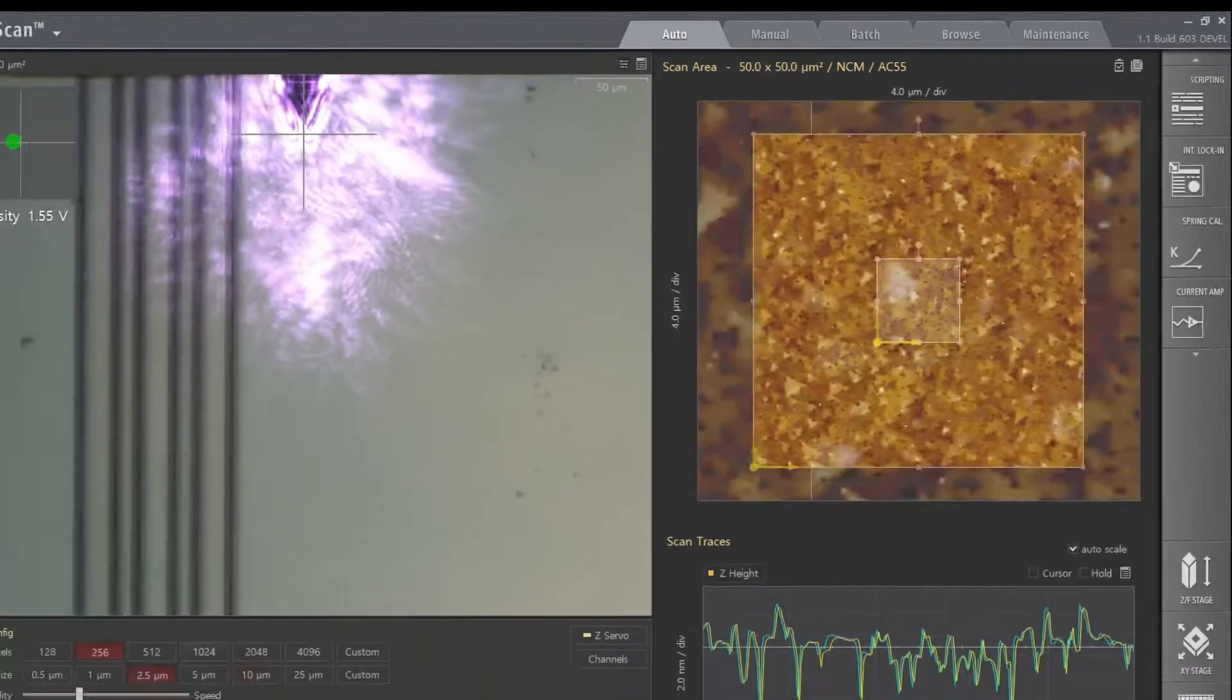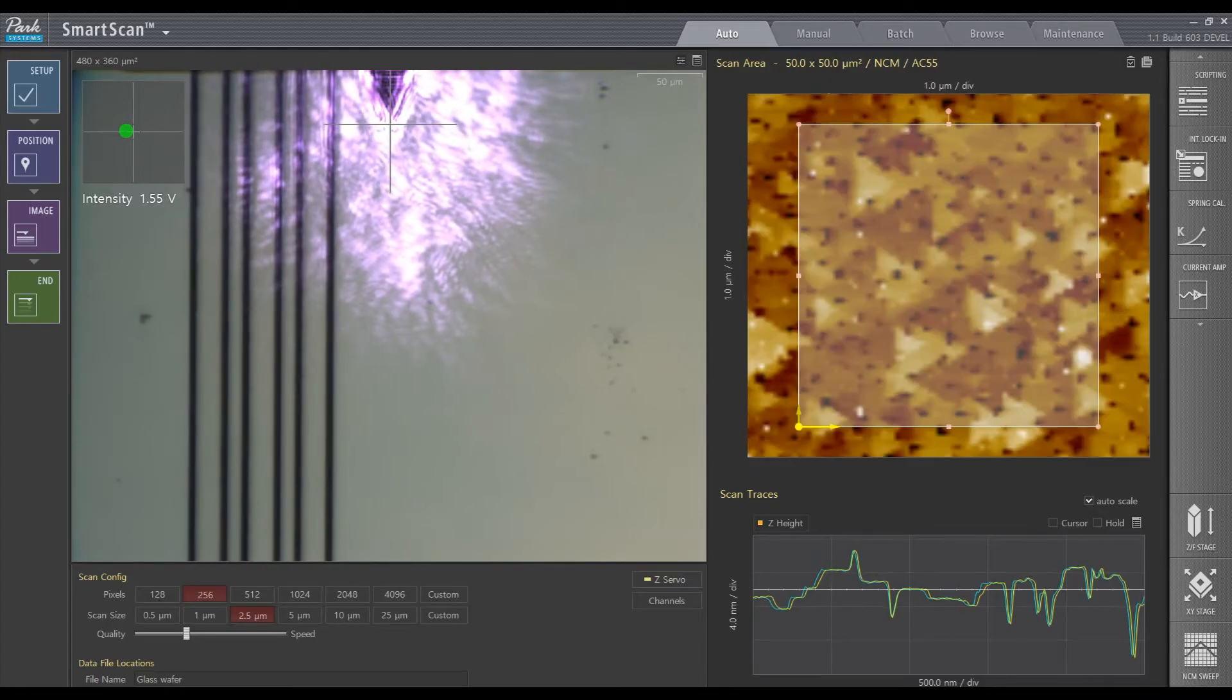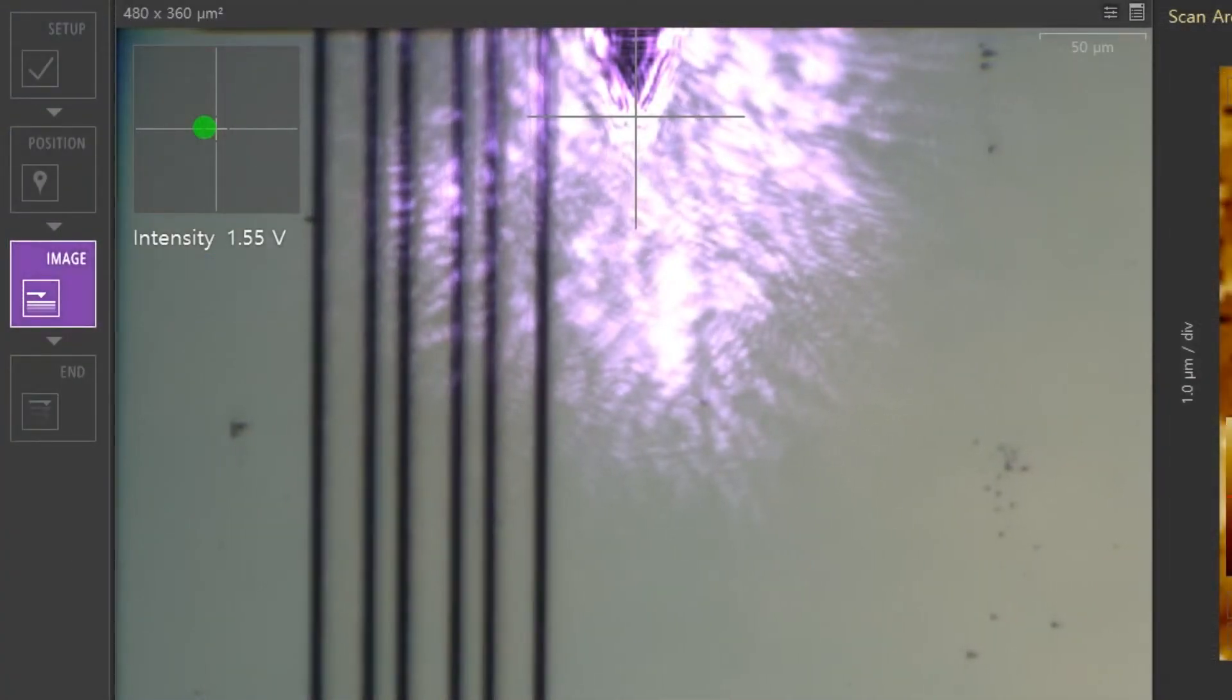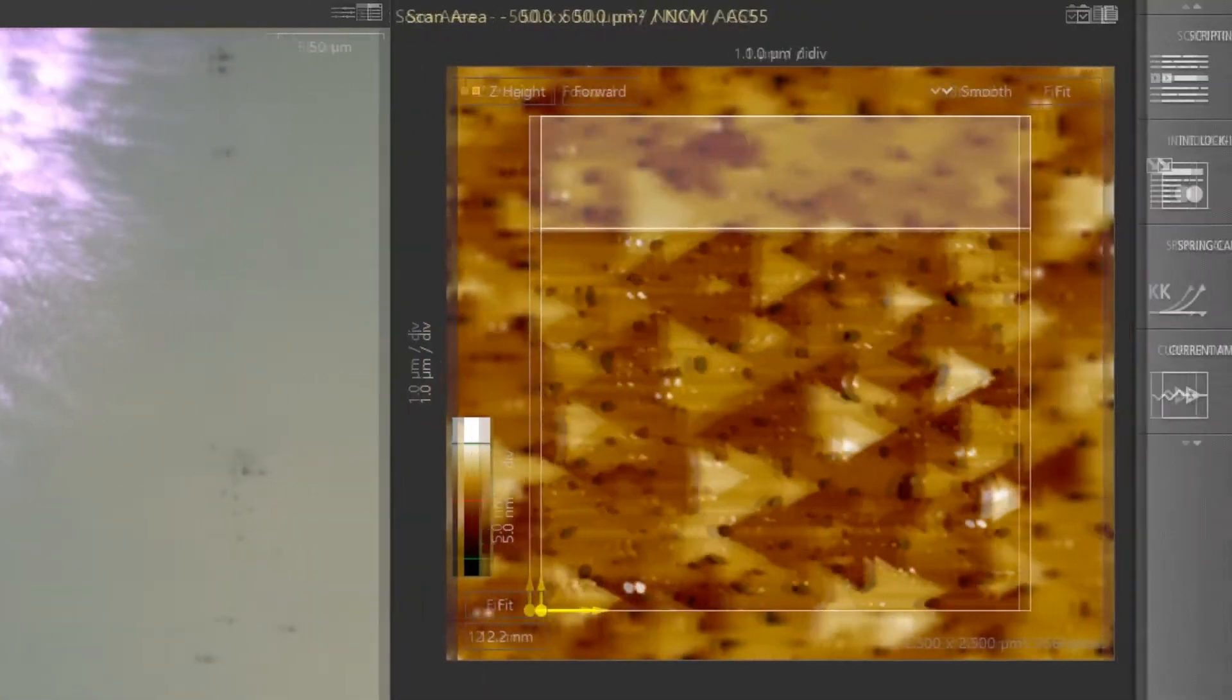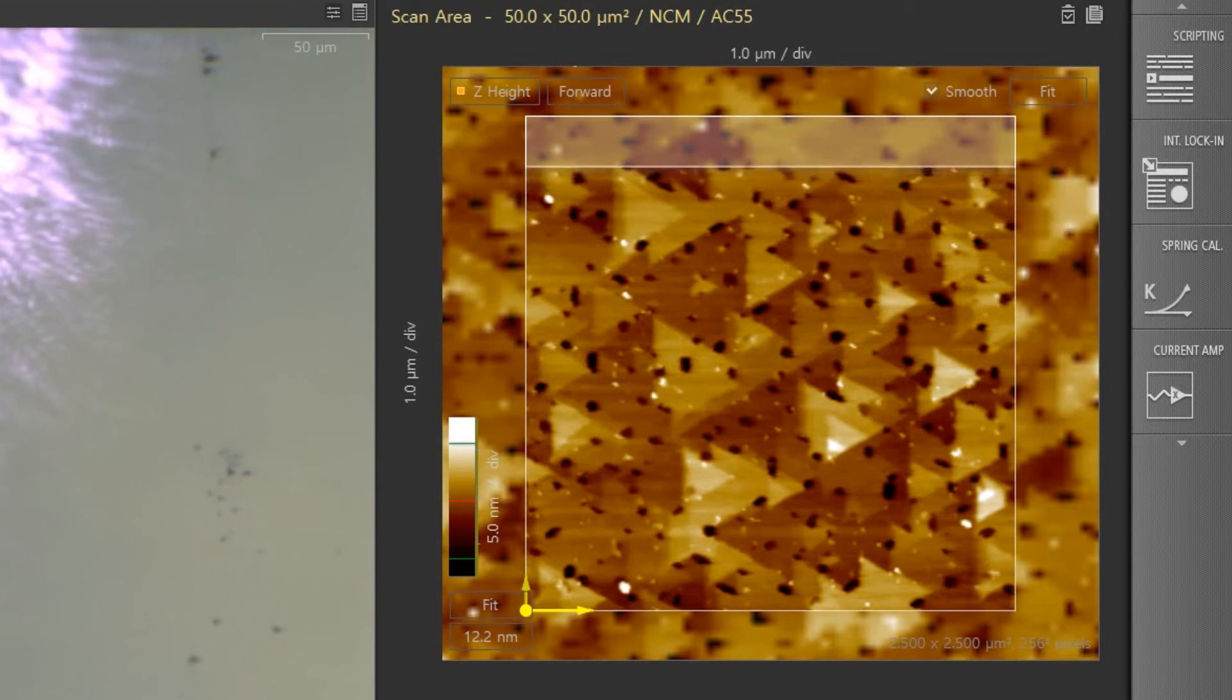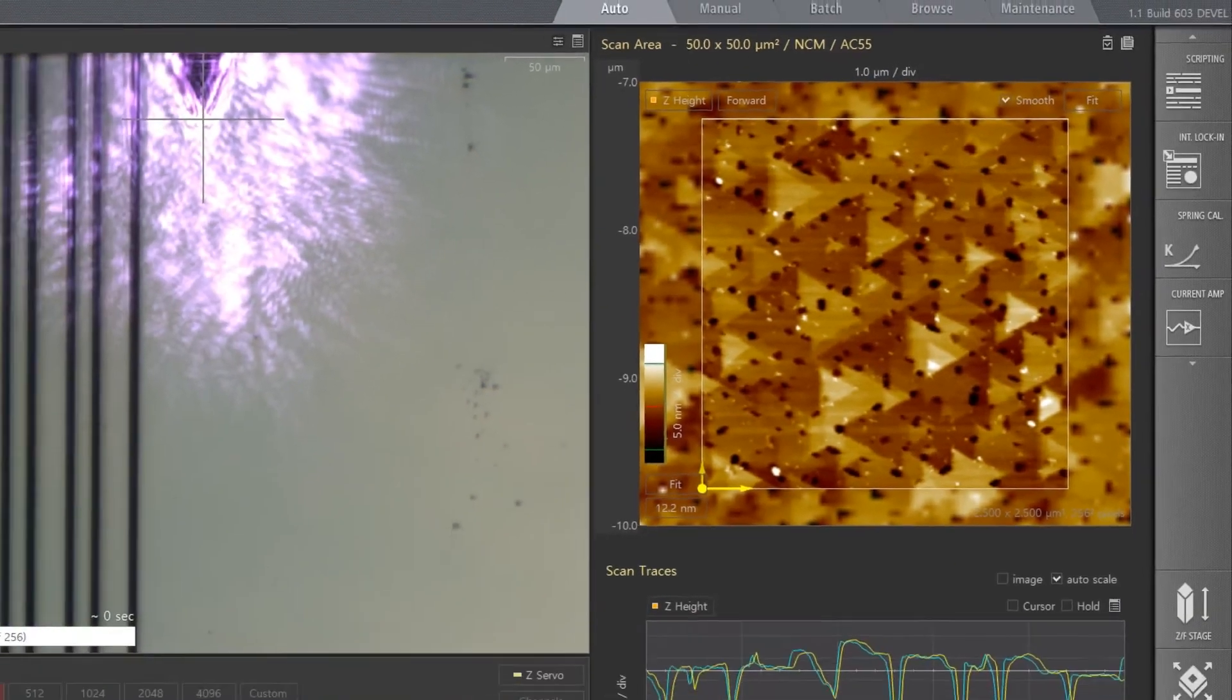After the image is acquired, if you'd like to zoom into a specific area, just select it and click Image once again. The software automatically calculates and uses the optimal scan speed and parameters to generate the best AFM image each and every time a new scan is started in Auto Mode.